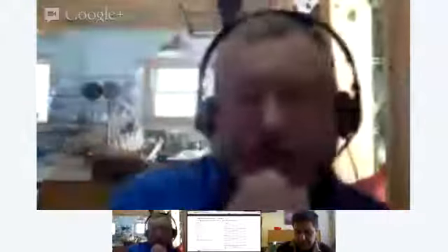Mm-hmm. Bob, this is an important feature here. Can I have visibility into Francois' notes of his R&D projects that he takes in his lab book? Just a second. Yes, by this afternoon. Okay. Not now, but yes, by this afternoon.